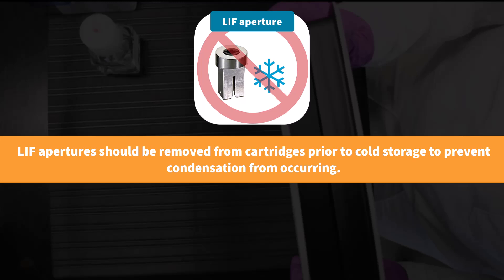If your capillary is used with the LIF detector, you should remove the LIF aperture prior to cold storage. This prevents condensation from forming on the metal aperture, which can damage its function.